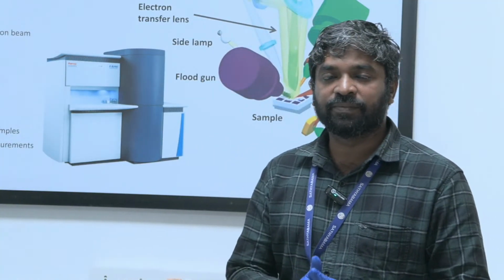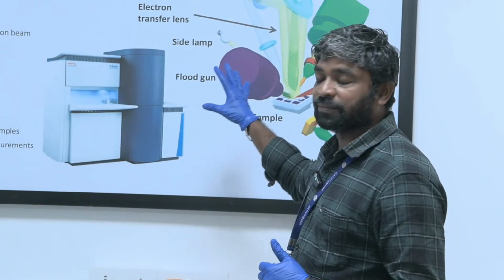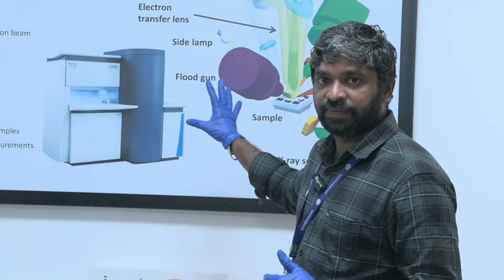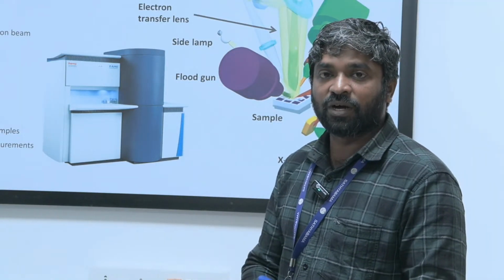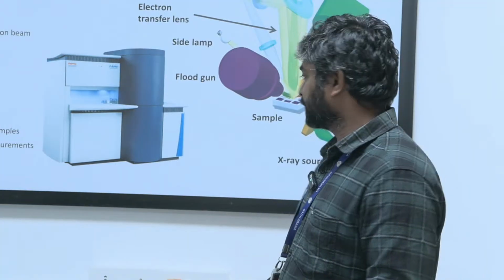Today I am going to demonstrate the XPS system. Before going into the system, I am going to give a pinch of the XPS instrumentation part: how it works and what components are involved in the XPS system.